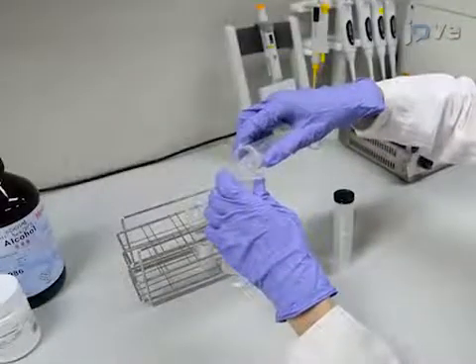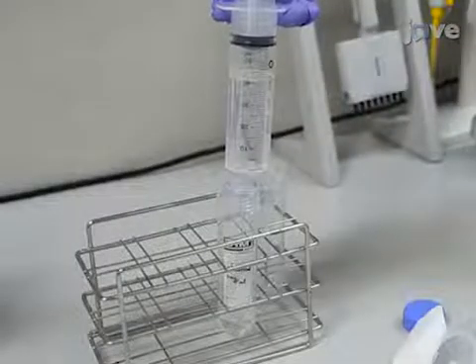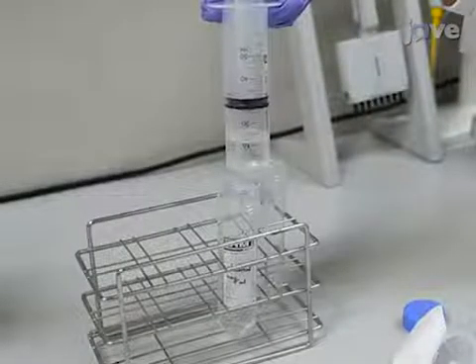Next, sterilize the cholesterol solution using a 50 milliliter syringe with a 0.45 micrometer syringe filter and remove any undissolved cholesterol.